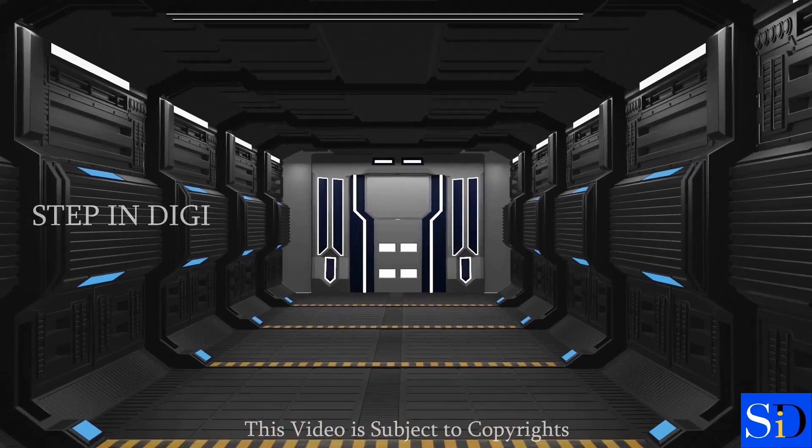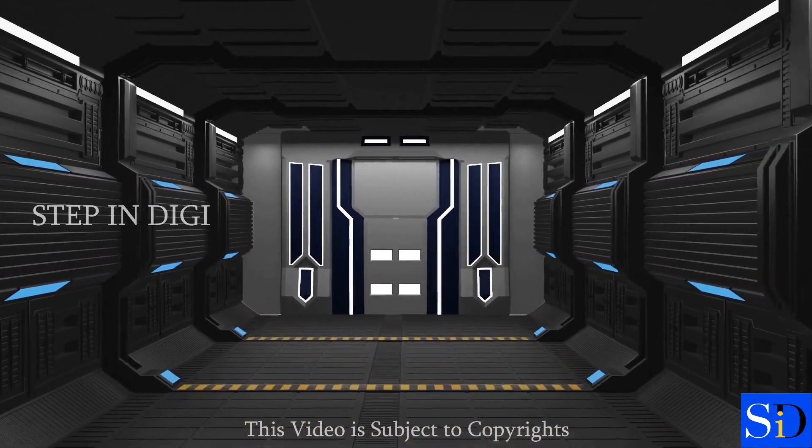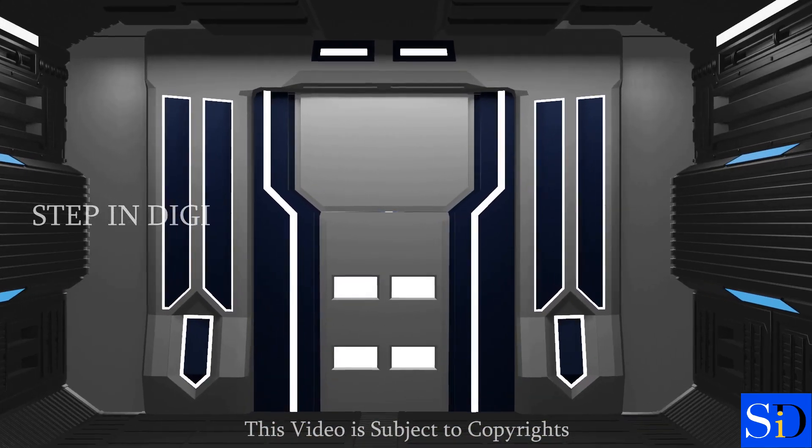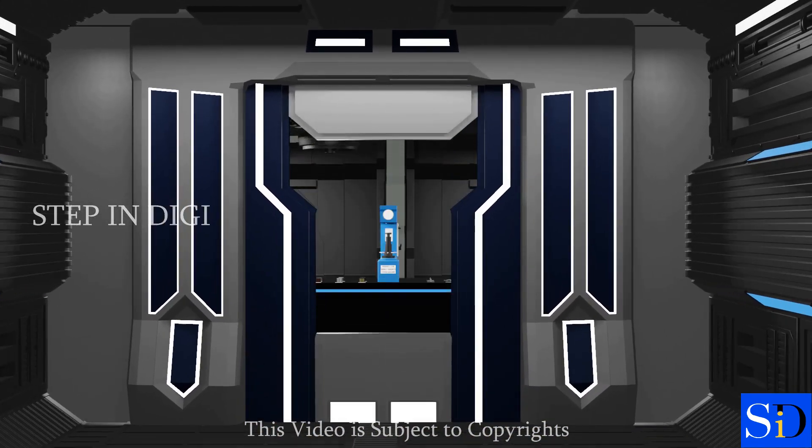Hello! Welcome to today's experiment. Today, you're going to do the experiment on testing the hardness of different metals using Rockwell Hardness Tester.